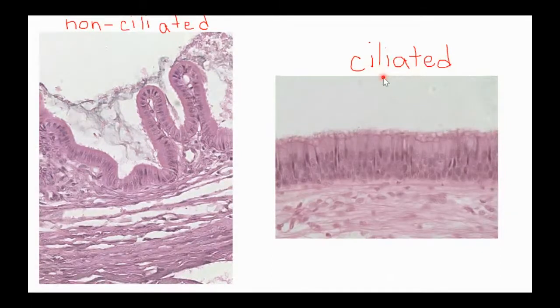The way we're going to identify that this is a type of ciliated tissue is if you look on the top of these cells, all these things up here that kind of look like eyelashes on the cell. All of those eyelashes are the cilia. And the cilia move back and forth, back and forth. They help to move the dust and debris out of your throat. They help to move the eggs down the fallopian tubes. Cilia, all about movement. If I'm moving stuff, I've got to be really long. So all of these little eyelashes that you see on top of these cells make this a type of ciliated tissue.